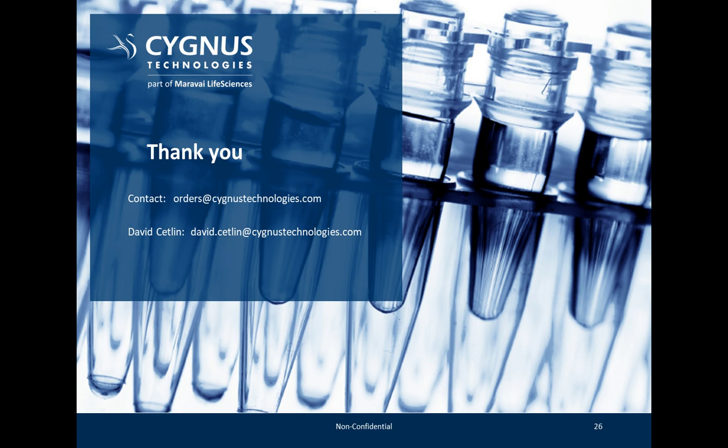The last question is, has the FDA evaluated data obtained with the mock virus particles? We get this question a lot. The FDA is certainly aware of this approach. They collaborated with us to generate the physicochemical data, and we've been in front of them in various forums like presentations or roundtables to discuss this as an approach. As of now, this technique is not a substitute for live viral clearance studies. Those are still required for submitting a BLA or an IND.